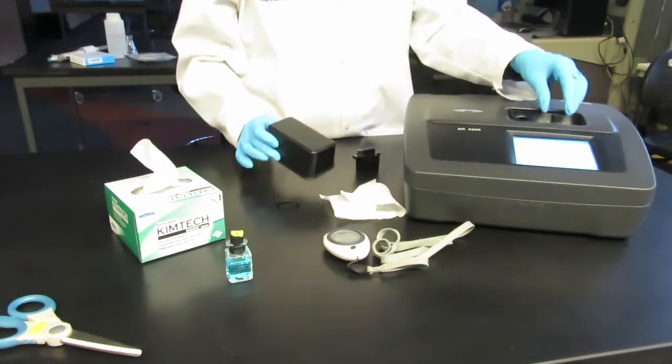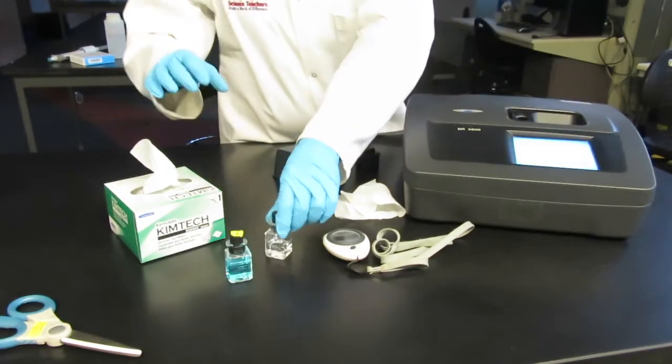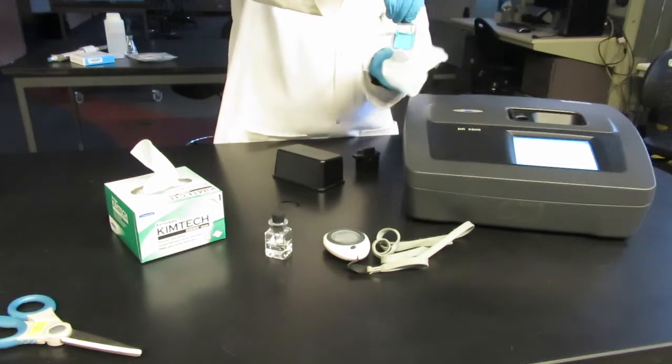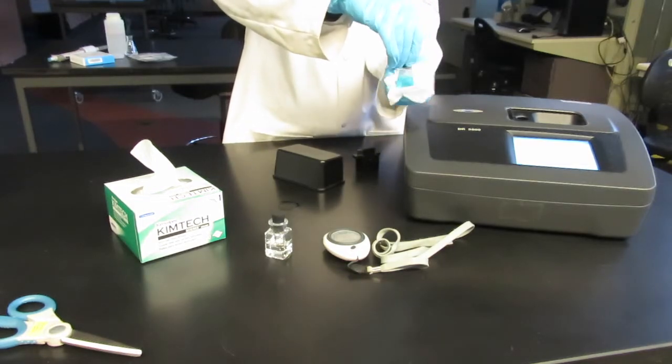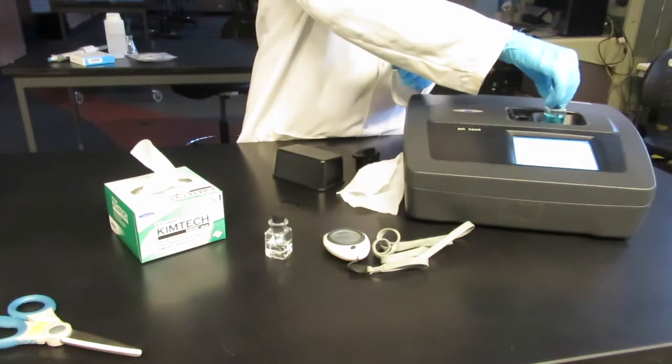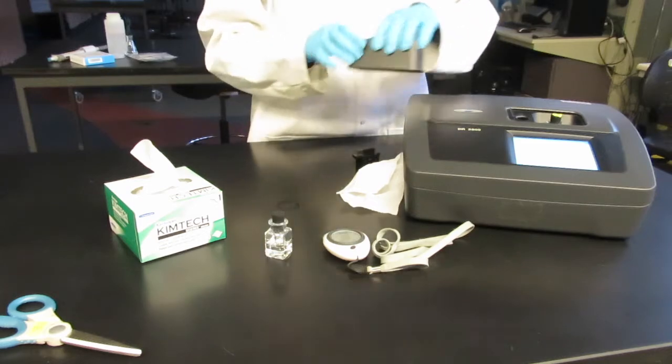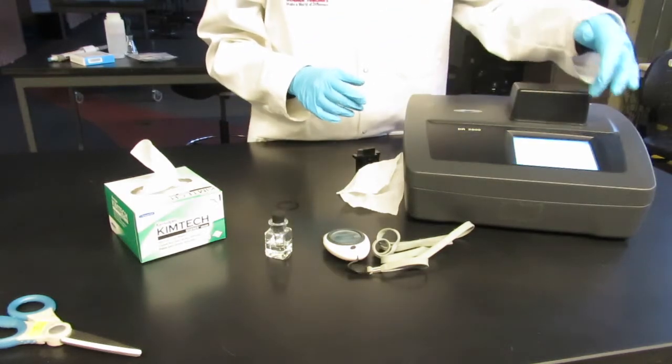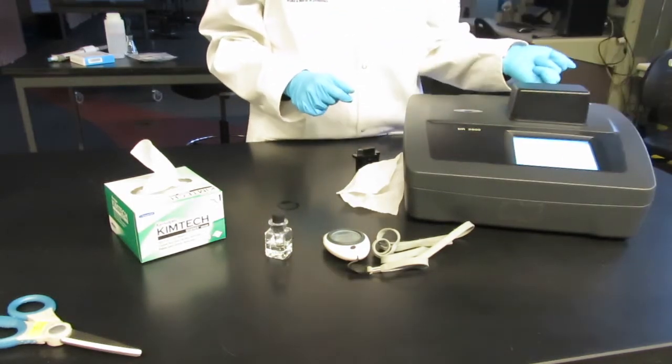Take the blank cuvette out of the spectrophotometer and using a kim wipe wipe your sample cuvette. You will need to measure this sample within 15 minutes otherwise over processing will occur and you will not receive accurate results.